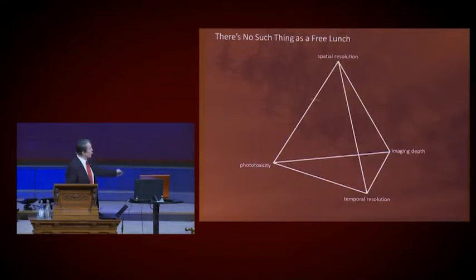So the moral of the story is that by getting away from that myopic focus on spatial resolution, and backing off a bit, we've been able to open a whole new application space that the extreme high resolution methods have not yet achieved. And so if that's the case, it begs the question, well, what if we back off further? What if we go to the diffraction limit itself?